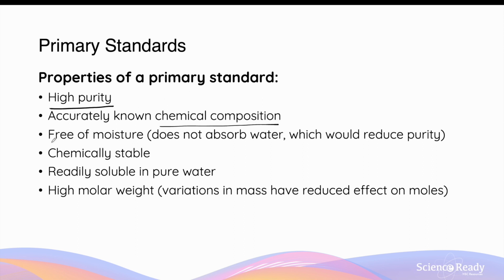The primary standard should be free of moisture. There are lots of substances and chemicals which can absorb water quite readily from the surrounding air. In the case where water is absorbed, the purity of the substance will decrease because there's some amount of water in that substance. And again, this would lead to inaccurate calculations of concentrations after the titration.